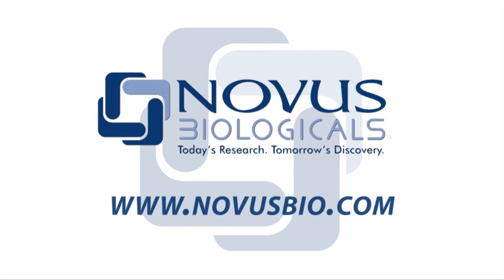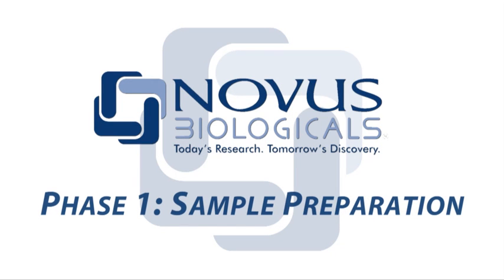Welcome to the Novus Visual Protocol series. In this video, we will learn how to perform all phases of a western blot using the most common methods for this assay.